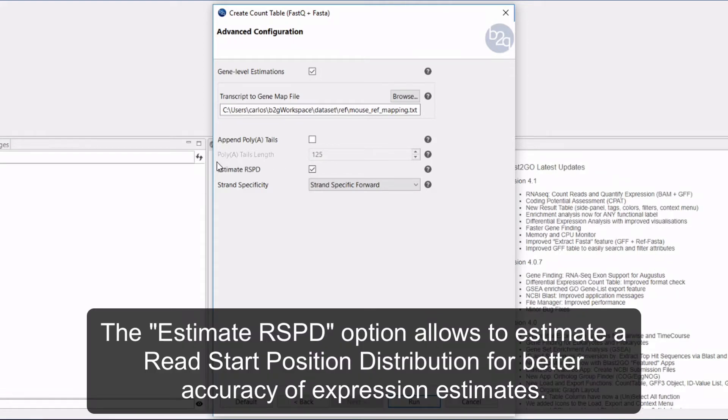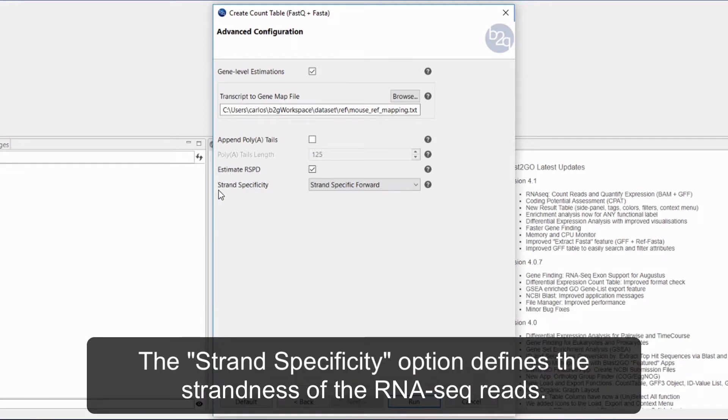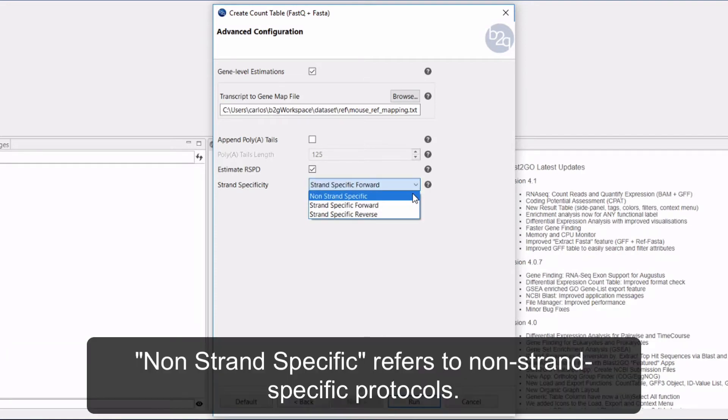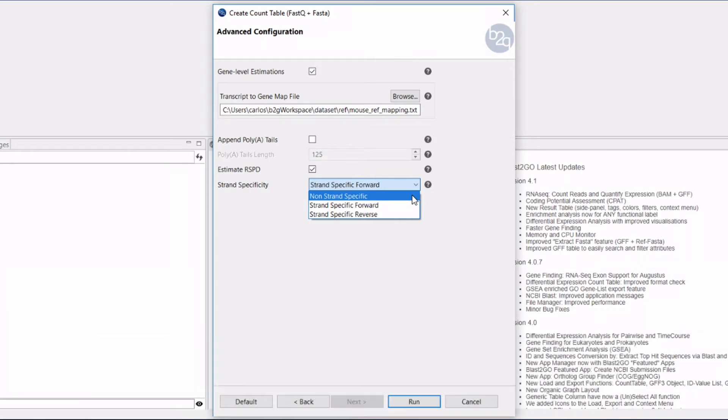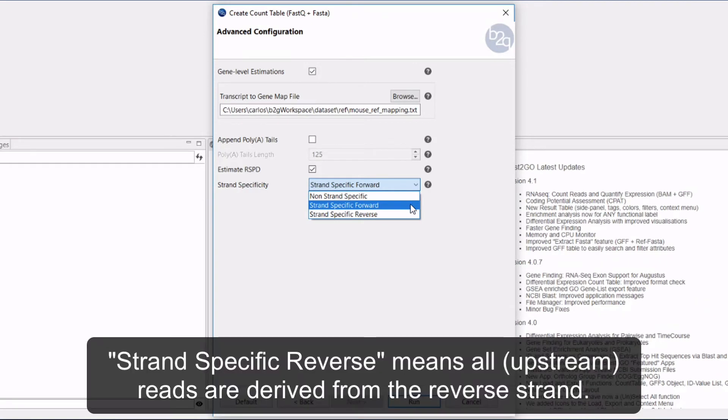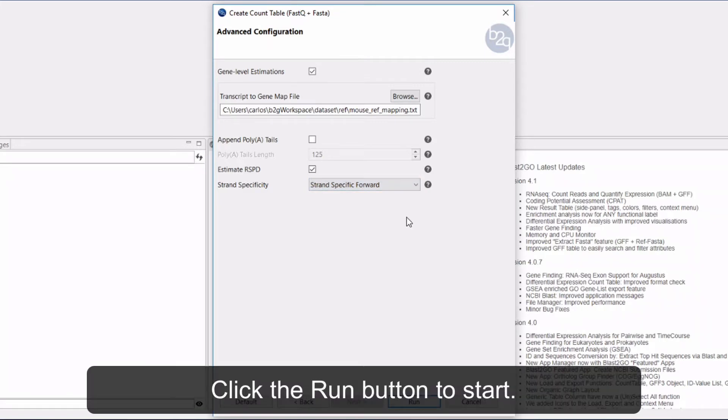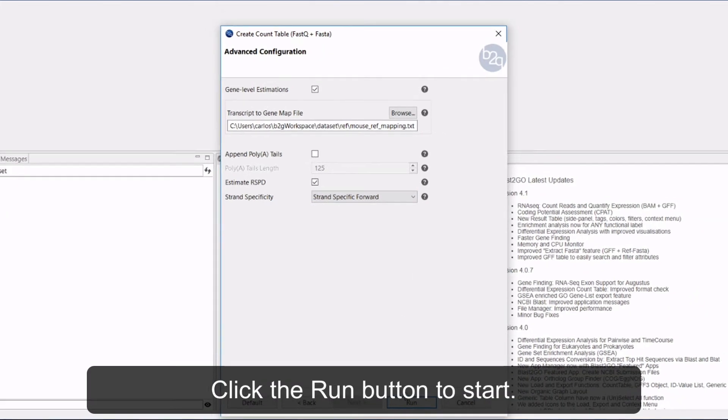The estimate RSPD option allows you to estimate a read-start position distribution for better accuracy of expression estimates. The strand specificity option defines the strandedness of the RNA-seq reads: non-strand specific refers to non-strand specific protocols, strand specific forward means all upstream reads are derived from the forward strand, and strand specific reverse means all upstream reads are derived from the reverse strand. Click the Run button to start.